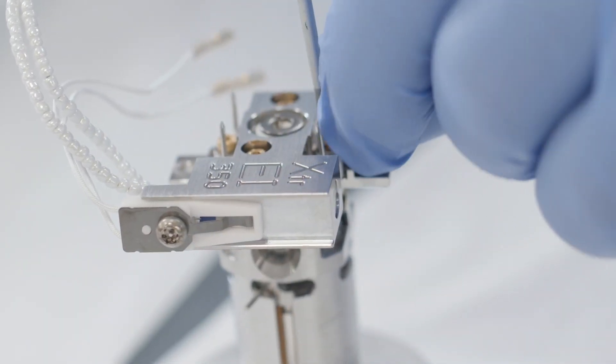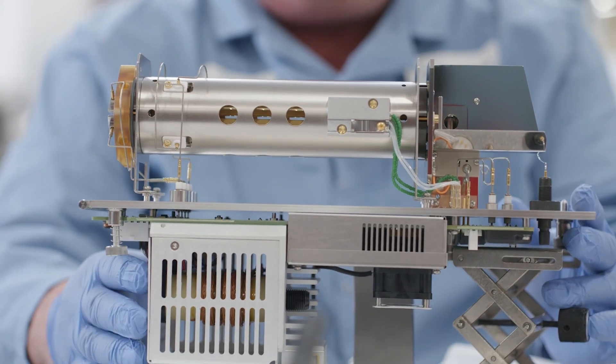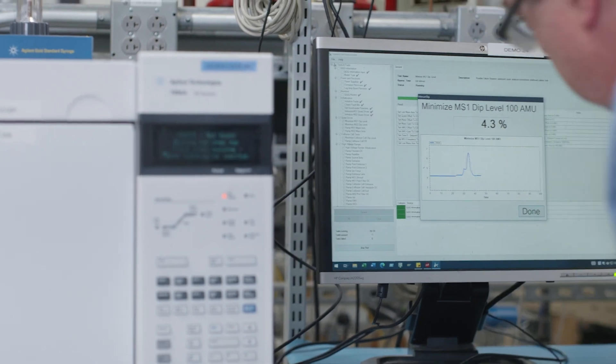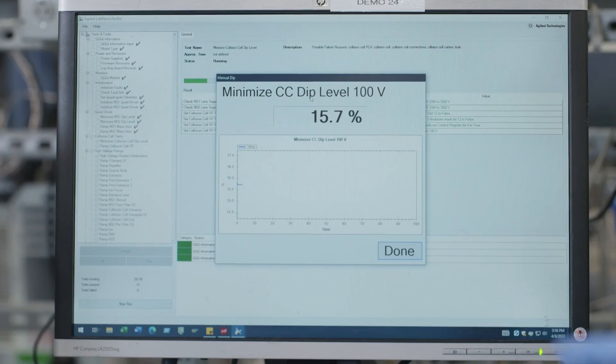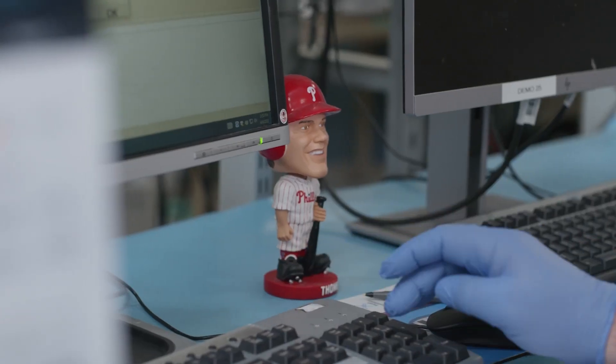On the triple quad, we replace the collision cell board and we'll remove the EMOD. We'll tune the source and the whole analyzer itself. It's running a calibration standard, and we have criteria for that calibration standard to meet peak shape, peak size and abundance, along with other factors such as air and water checks and so forth.